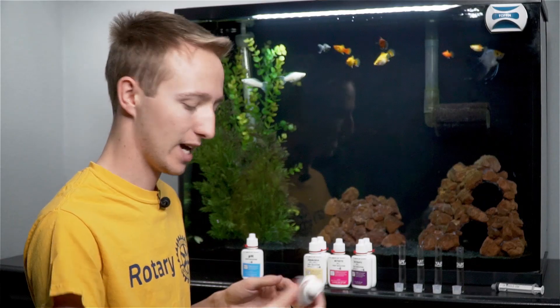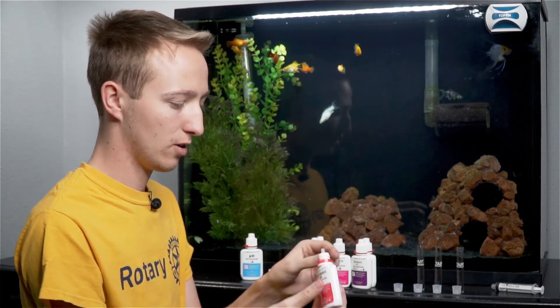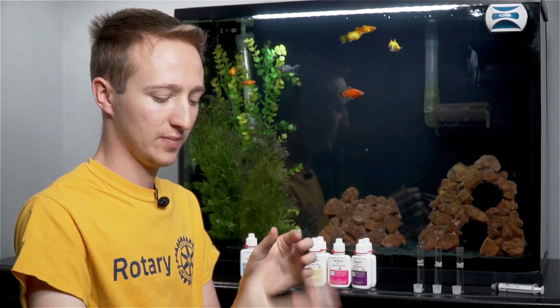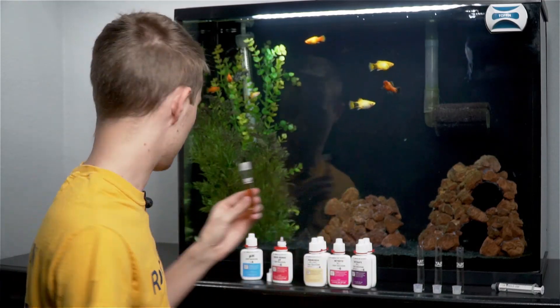Next is going to be high range pH. Give it a little shake — this one says to add five drops. So I add five drops to the water, cap it, invert it a few times, and that one's ready to go.